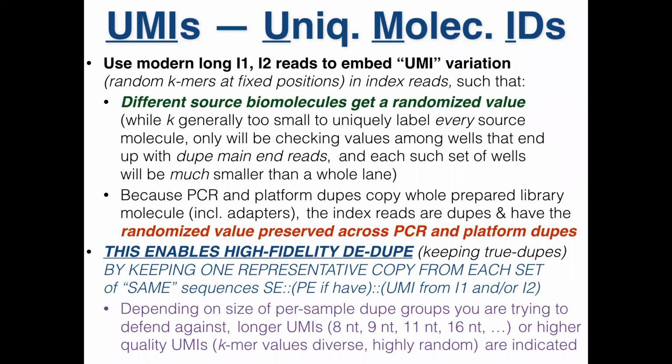Ideally, it's 25% each of A, C, G and T, independently across all the Ns. So if I ask for 5 Ns in a row, that's 5 bases, which is 4 to the 5th power possibilities, 2 to the 10th power, which is 1024. Ideally, if I order an oligo with 5 Ns in it, I have 1024 variants in my final tube, all of equal representation. That's an ideal that can happen, but we might not need that ideal to be effective. We just need lots of variation.